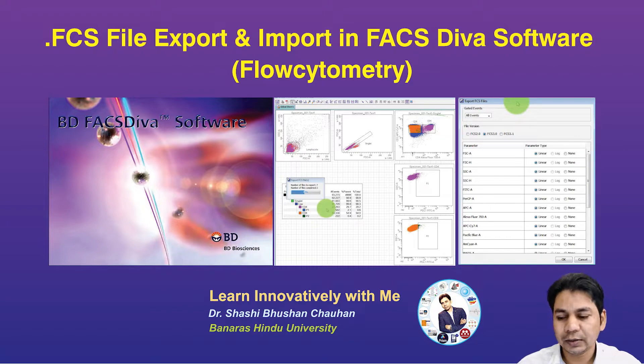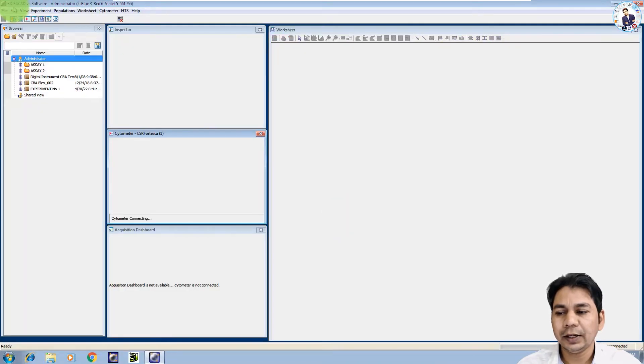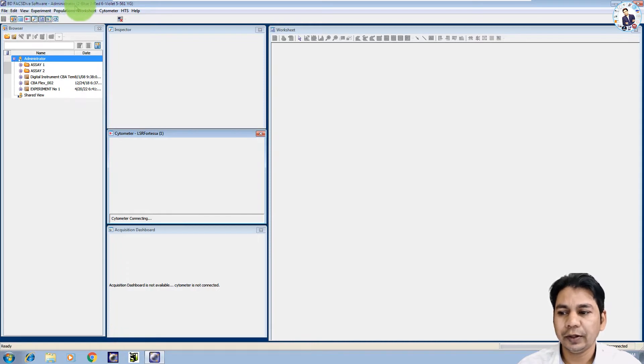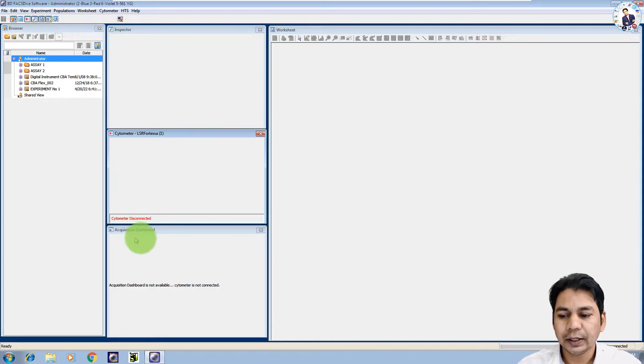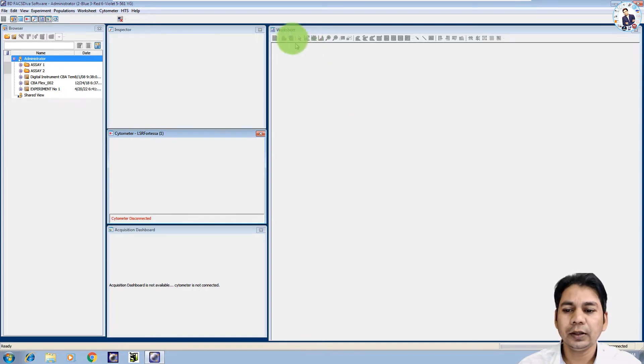You can see on my desktop screen the interface of the FACS DIVA software: menu, browser, inspector, cytometer and acquisition dashboard, and also the worksheet.